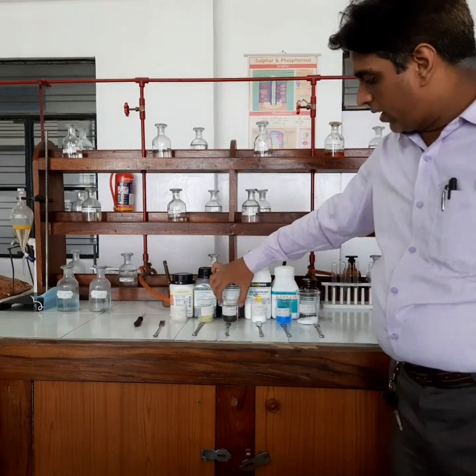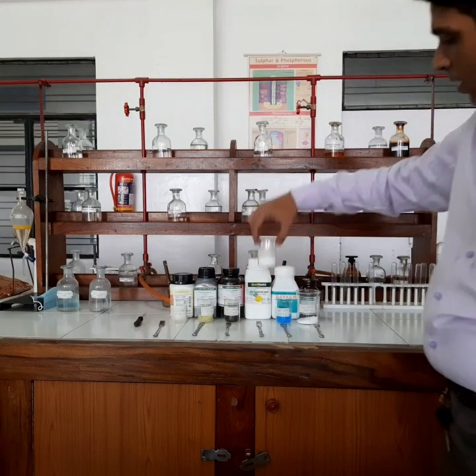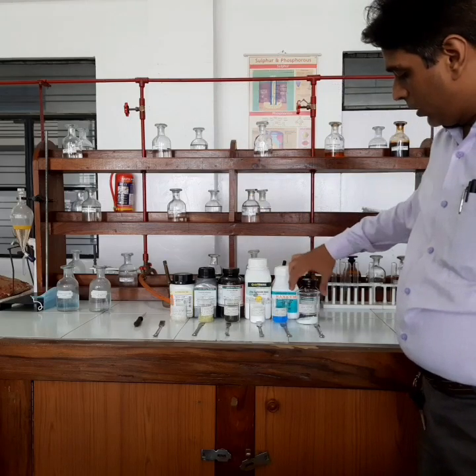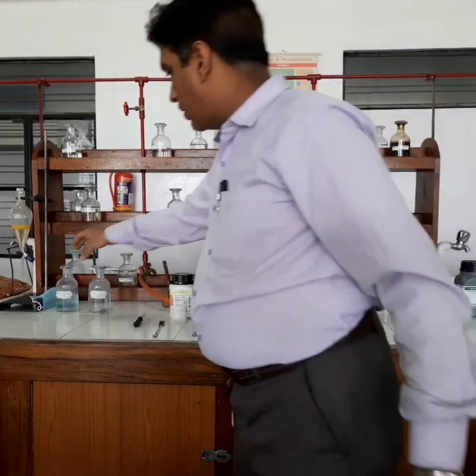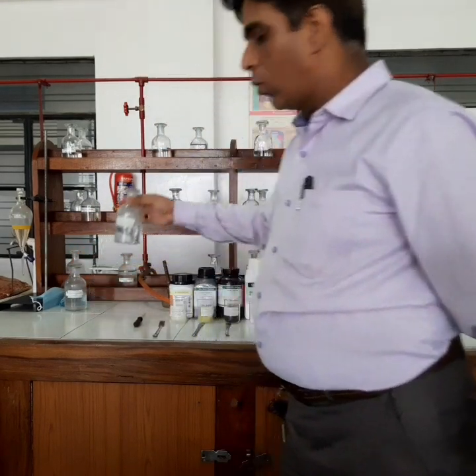Then I have got ferric chloride here for testing ferric ions. Then I have got salt of zinc for testing zinc ion. I have got a salt of copper sulfate for testing copper ion. And then I have got lead salt, that is lead nitrate, for testing lead ion. And I am going to test them with the help of these two reagents, that is NaOH, and then the second reagent that I am going to use is NH4OH.